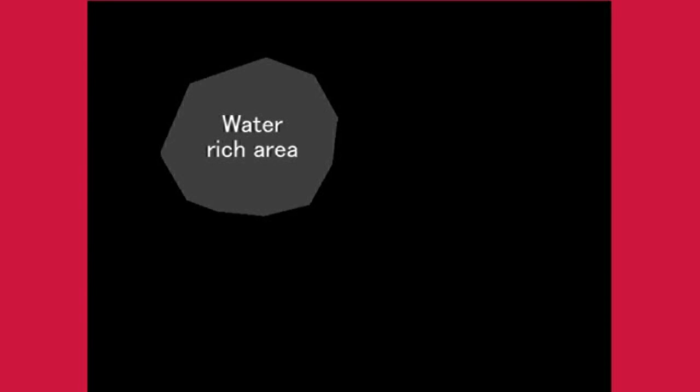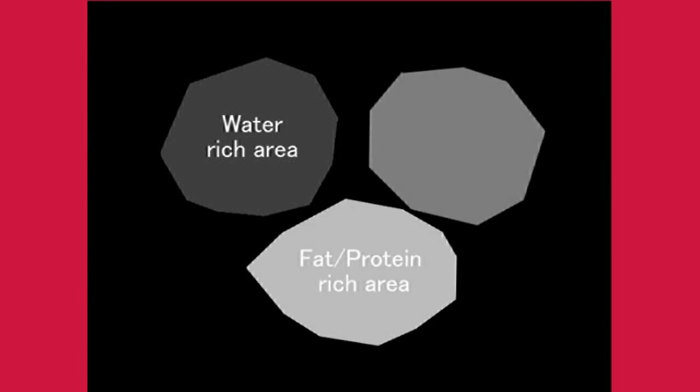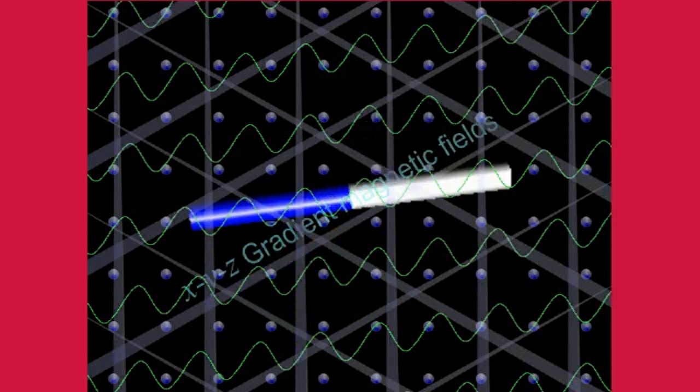For the above reasons, the T1 weighted images create an image based on the difference in spin lattice relaxation time. The signal of the part containing many large molecules becomes stronger, so the picture shows macromolecules such as lipids whiter. On the other hand, at the moment when the magnetization collapses by 90 degrees, the magnetization rotates as one as a whole at first.